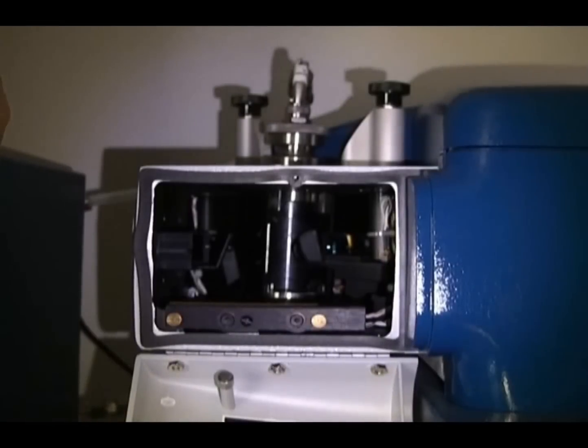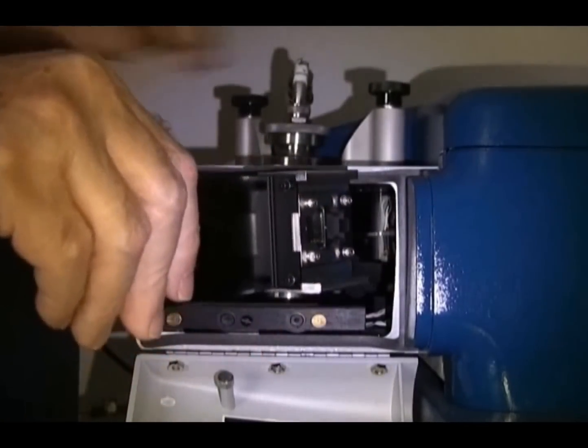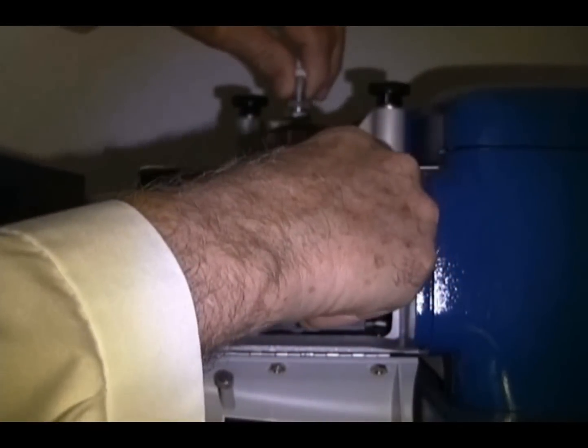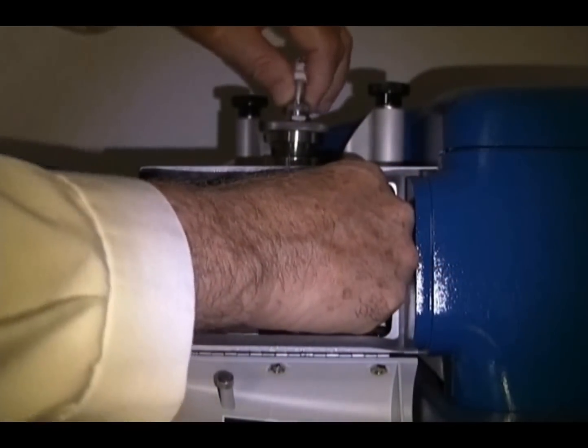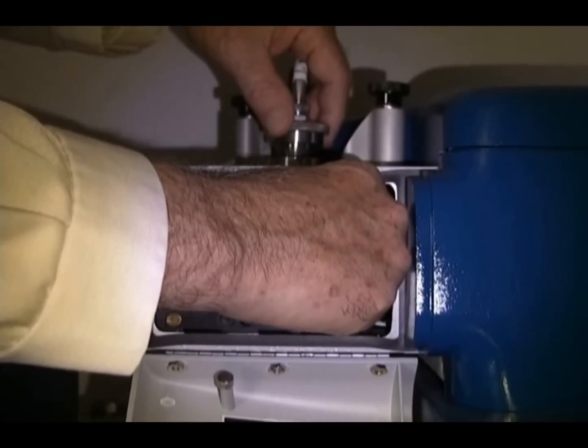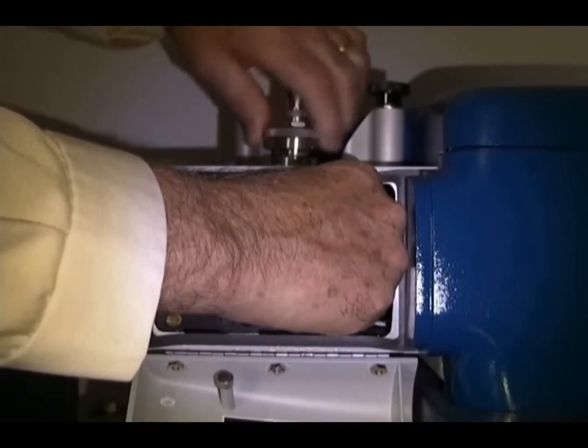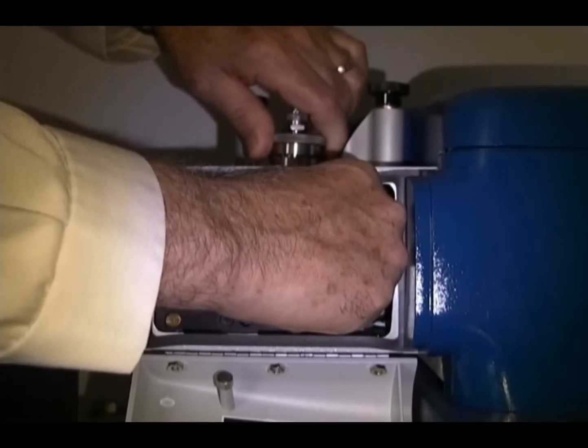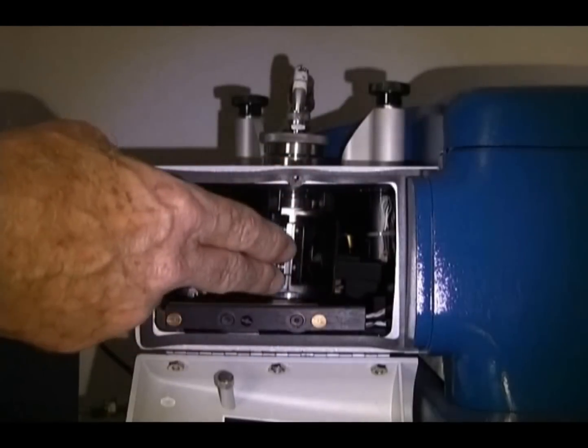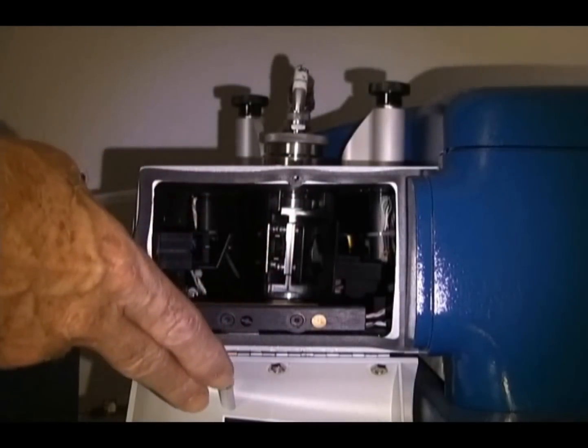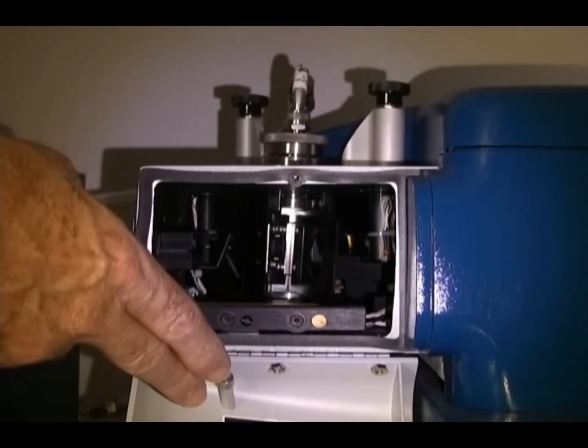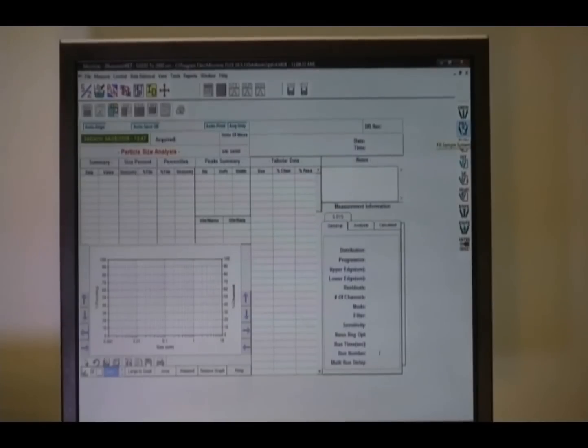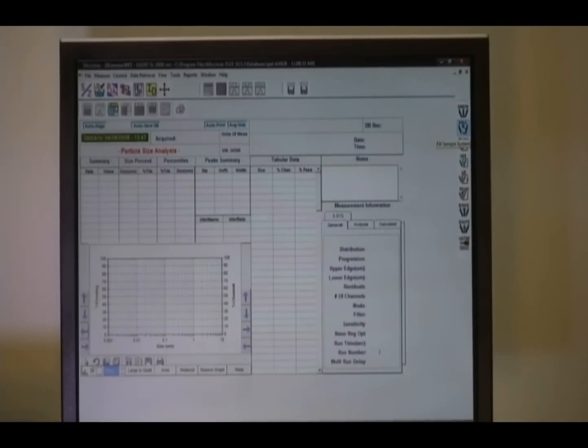Now, to replace the sample cell, we take the cell by the sample cell holder, loosen the knurled nut turning counter-clockwise, lift up on the tubing and place the sample cell into the holder, forcing it as far back as possible to contact the pin. Now, I will turn the knurled nut clockwise, holding the sample cell in place until the knurled nut becomes tightened just snugly. At this point, the sample cell is now replaced. We will leave the sample cell door open so that when we fill the system for the first time, we can check just to be sure that there are no leaks in the sample cell compartment.